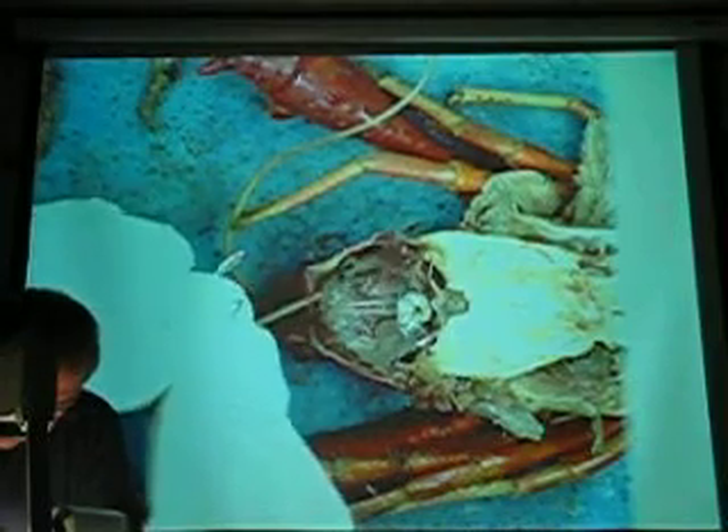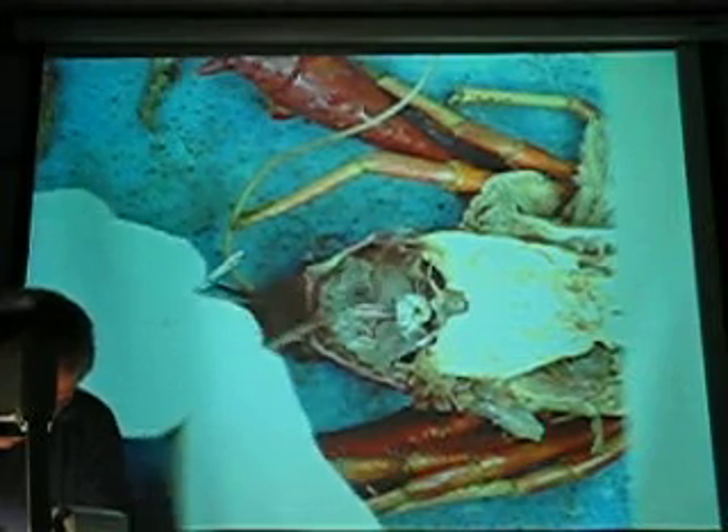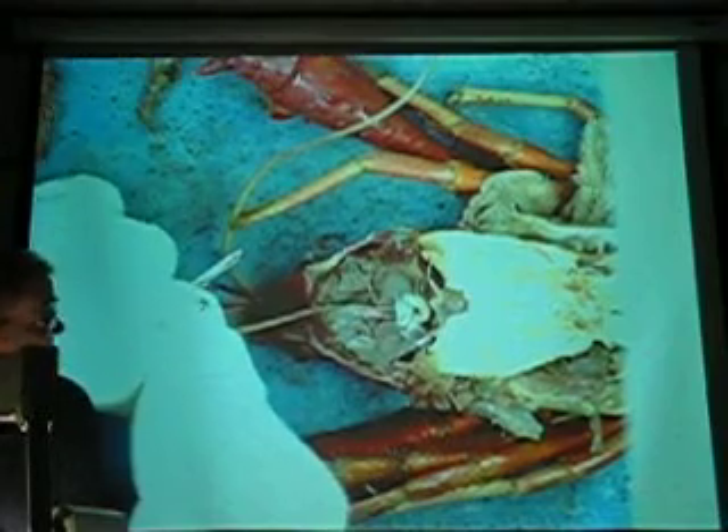You got forceps with you? No, I don't. Here I flipped it — there it is. Pretty clear?